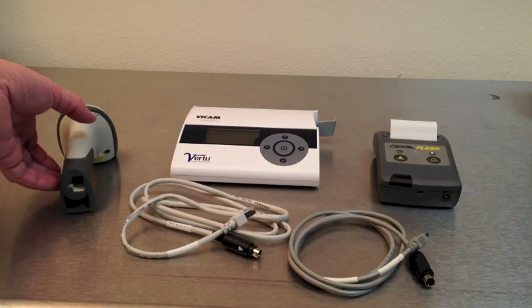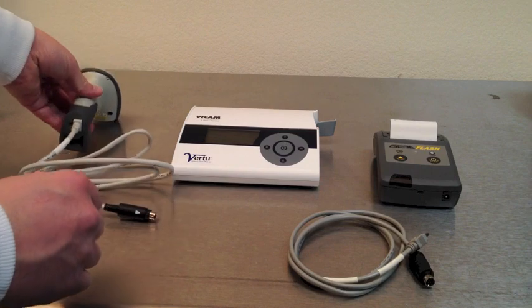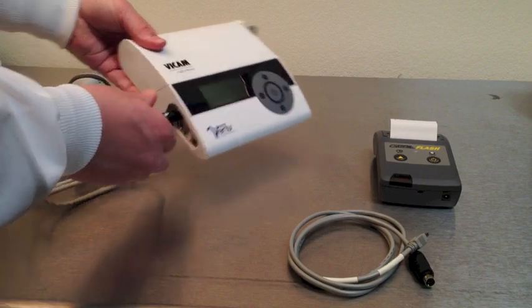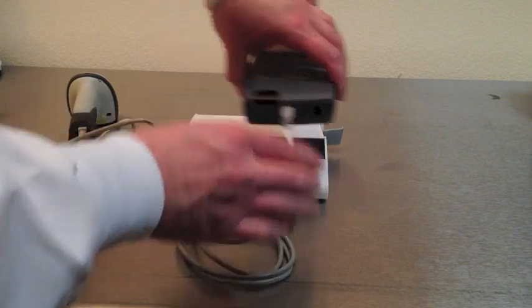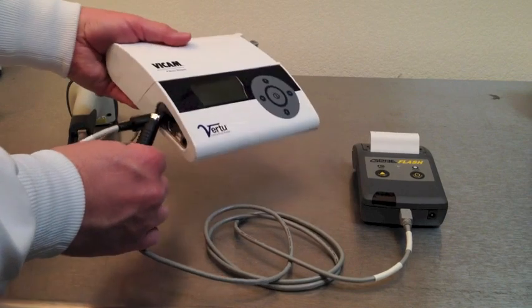The VR2 equipment package includes a barcode scanner, used to choose the test you're selecting, as well as a printer to print results. Attach the wire to the bottom of the barcode scanner and plug into one of the two ports on the side of the VR2 — either one is fine, they are interchangeable. Plug the USB port to the bottom of the printer and then plug it into the other port on the side of the VR2.